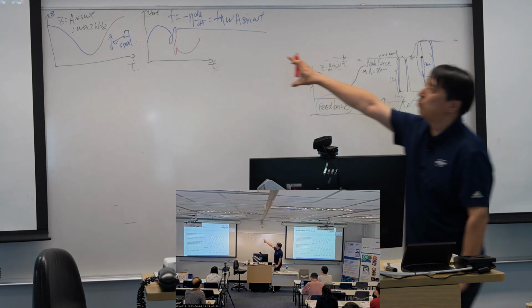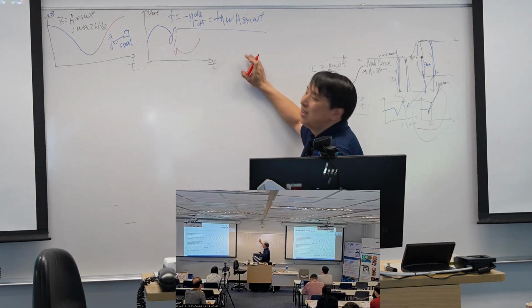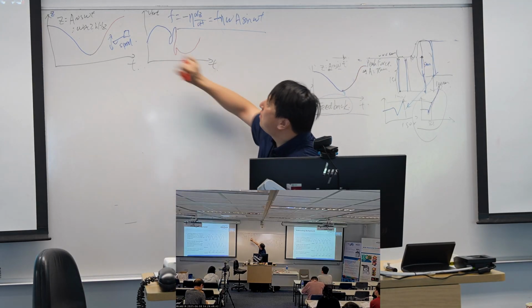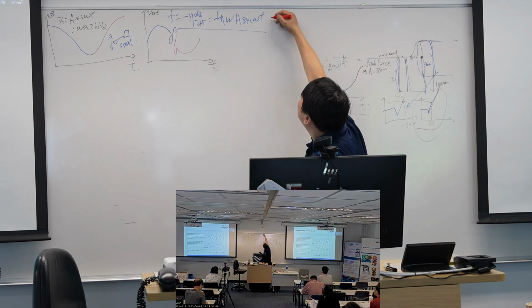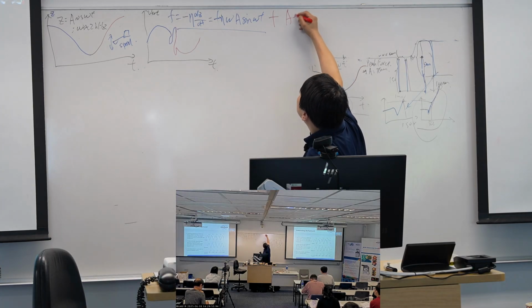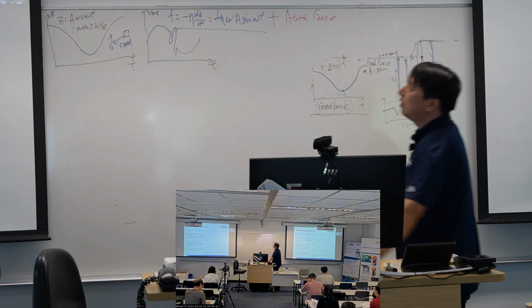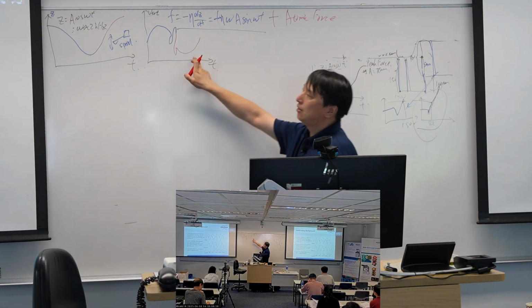That's the force curve we would observe in principle. This is the hydrodynamic force plus the atomic force, the original force curve we get.